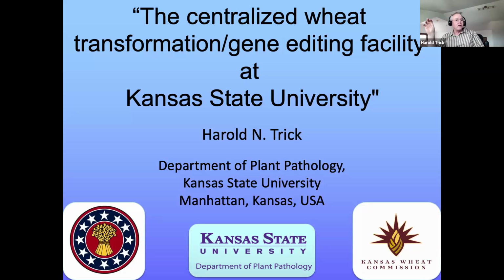The idea would be for researchers associated with the SCAB initiative to send us their gene constructs. We'd actually engineer the wheat and then send back out the seeds to you all. So that was the underlying concept. And this has been going on now for probably 3 or 4 funding cycles. It's been several years now, and I think we've been having some pretty good success with this. But I wanted to go over what we actually do for this.